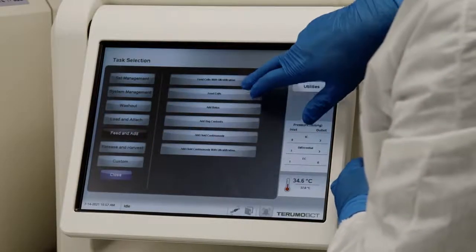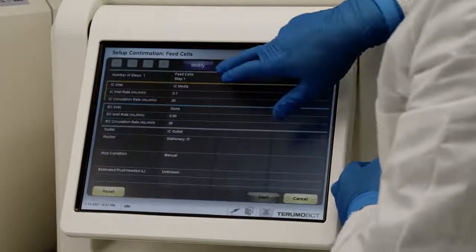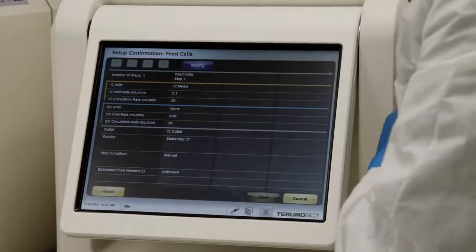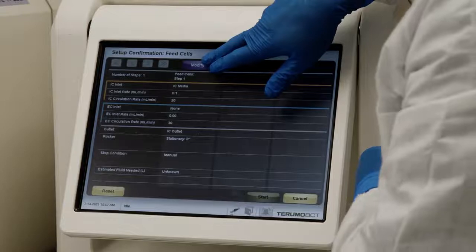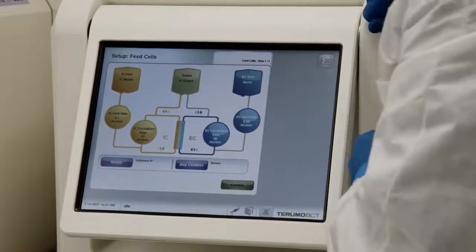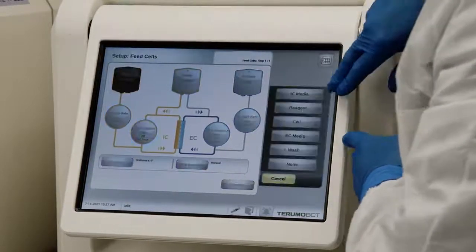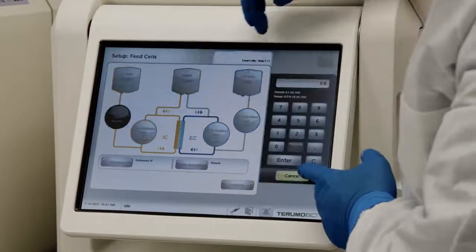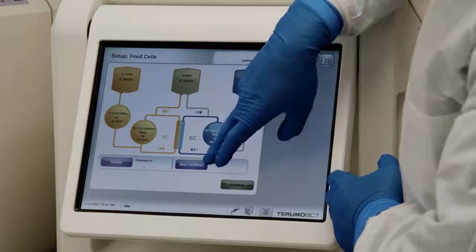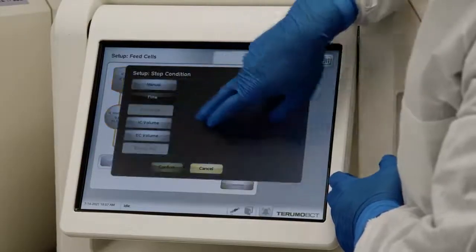For instance, we'll look at a feed cells task. You can set it and run it with the default settings or you can change the settings simply by clicking this modify button. Here you can change the reagents, flow rates, and stop condition. For instance, time.